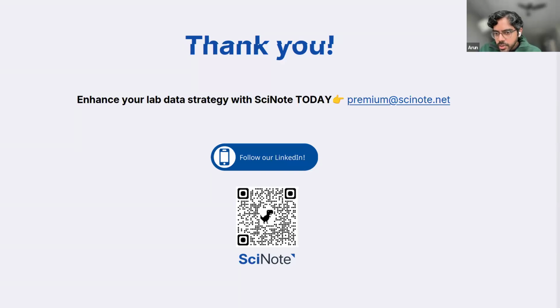Okay, I see another question. Is it possible to link SciNote to an instrument so data is transferred automatically? Yes, it is possible using SciNote's Open API. The short answer is yes, but there is also an it depends component. If your instrument is being powered by a computer that has a software and the software has an Open API, then it's a matter of just connecting your instrument's API to SciNote's and you can automate the data transfer.